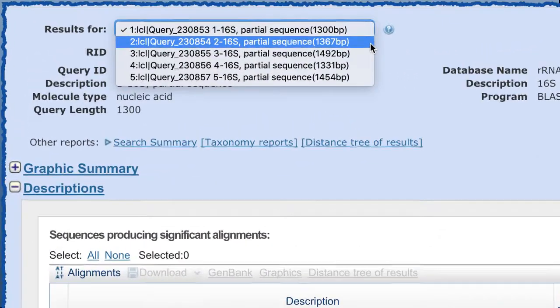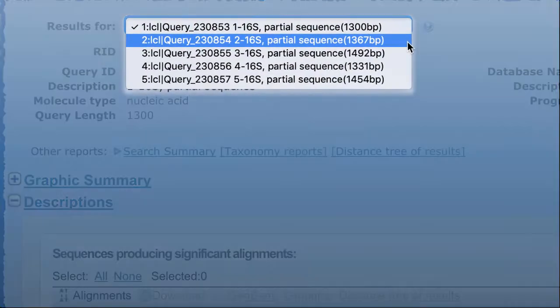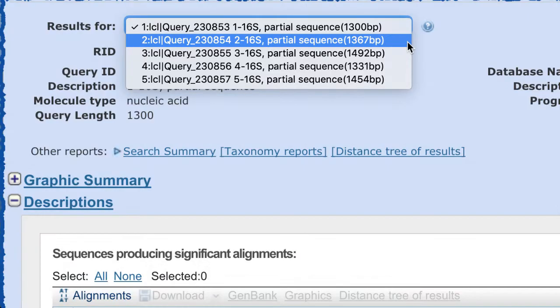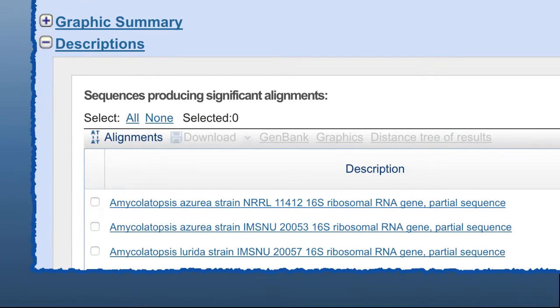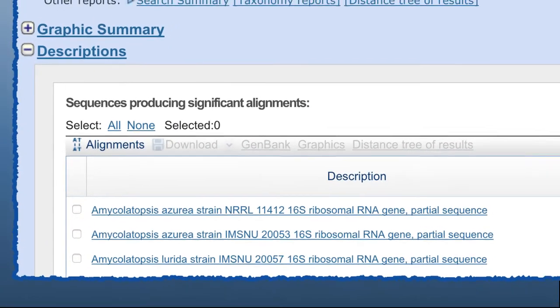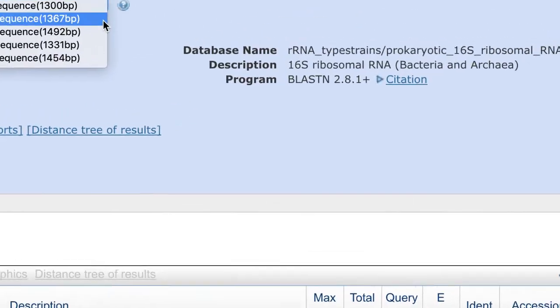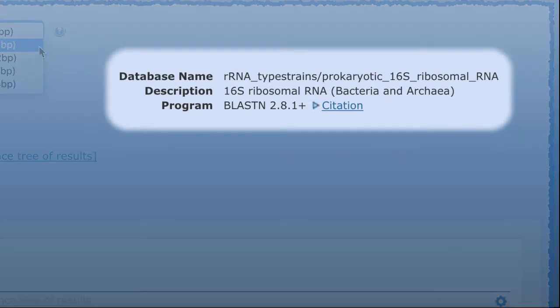We know that many of you want to run BLAST on your 16S sequences to identify the source organism. The best way to do that currently is to search a subset of the NT database containing only 16S sequences. I'll show you how to select that database and also provide a few search tips along the way.